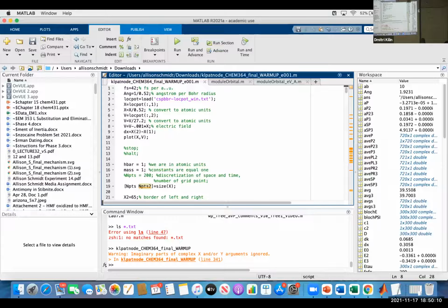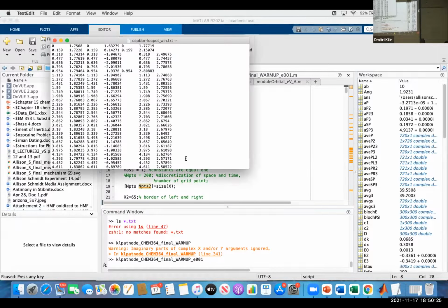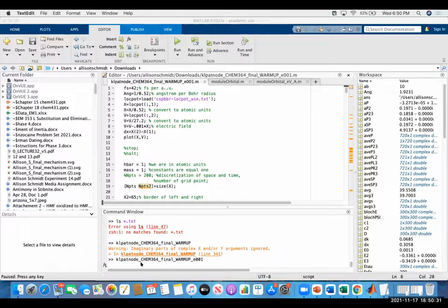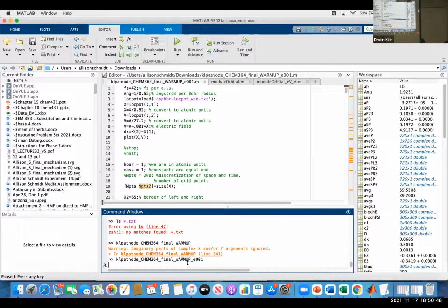And now let's run. Let's just run. So I think it funnels the image to one of the figures. Please bring the latest figure up so that we can look at it, the figure from MATLAB. See, it should have several windows. If nothing pops up, just click Enter and see what happens.